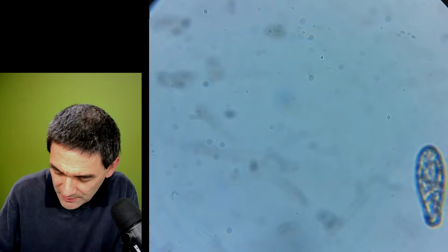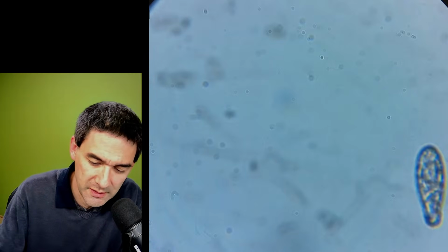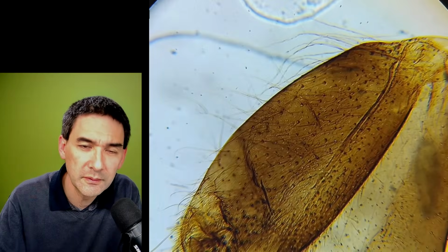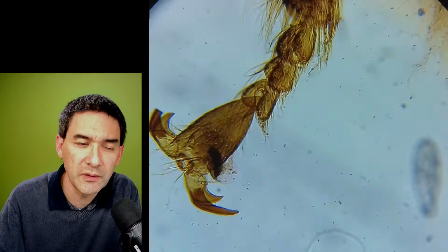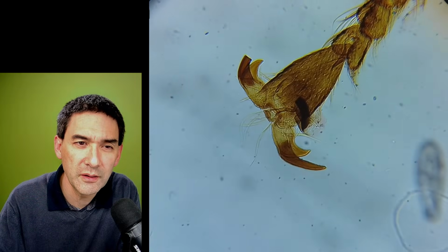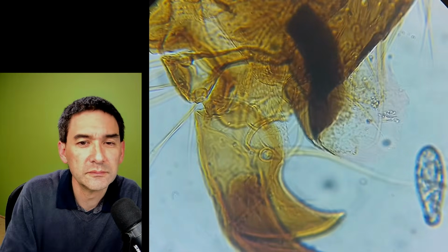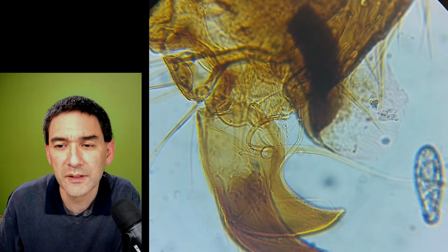What is this here? Again, honeybee, a leg of a honeybee in this case. It's again a little bit too big. This is the leg of, and let's see if the claws are also included. Here they are. And we go up.